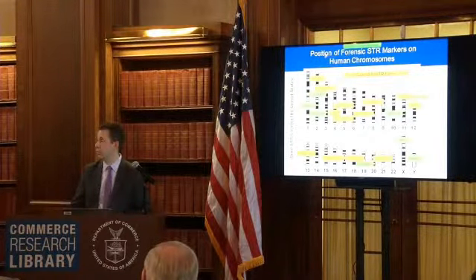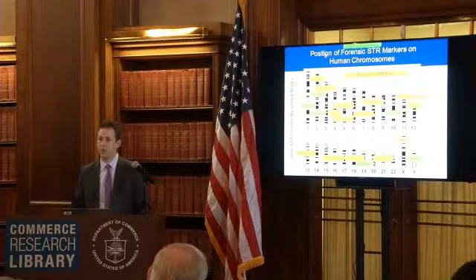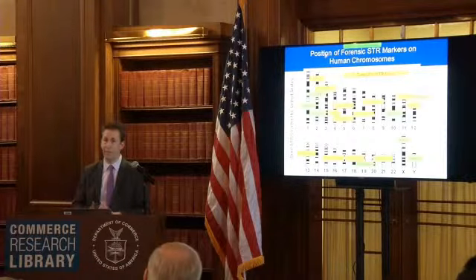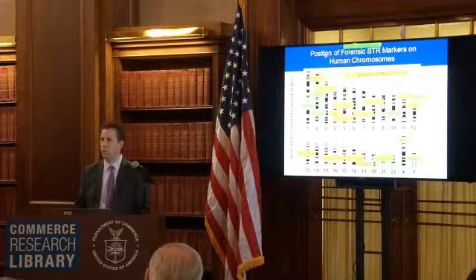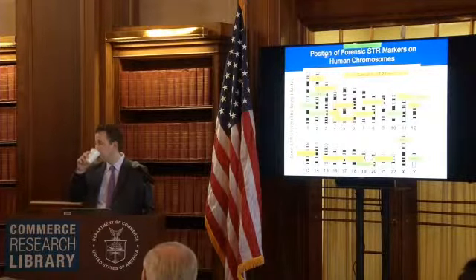So if you weren't able to type it, you would get limited information. So you could think of a forensic case where maybe someone touches something, you try and type it, you only get, let's say, 5 markers to work. It only gives you a probability of 1 in 10,000. That's just the limited information that you have out of that. So, yes.